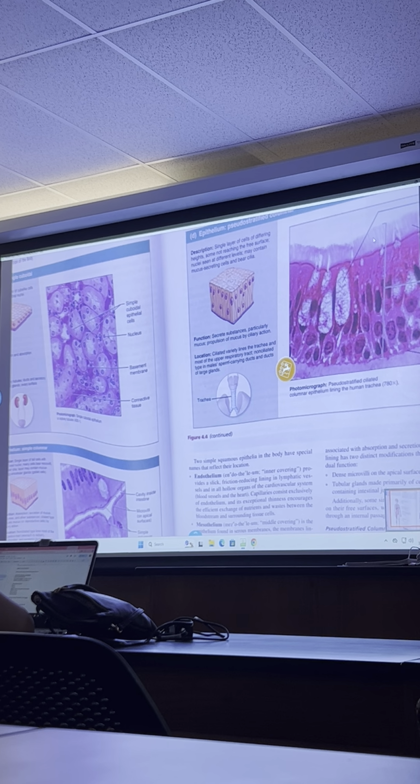Okay, so you saw this on your trachea slides, right? But remember how little they looked? They were small, and they were kind of stuck together. This is nicely resolved here, but on your slides, it was not so nice to try to look at them. They line the trachea, sweeping out the dust and mucus up towards your mouth so you could spit it out or swallow it down into the stomach acid. That's what you do. The cilia do that sweeping action.